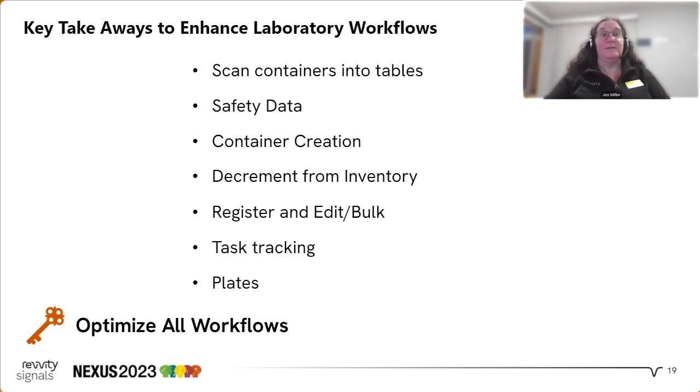Create and track tasks with materials and container information without having to type in or remember numbers. Add materials to plates through tasks, materials, or sample tables, as well as scanning containers.